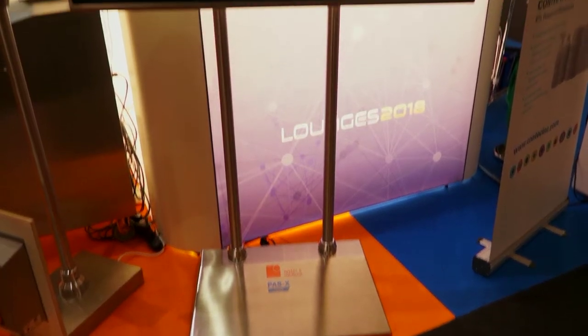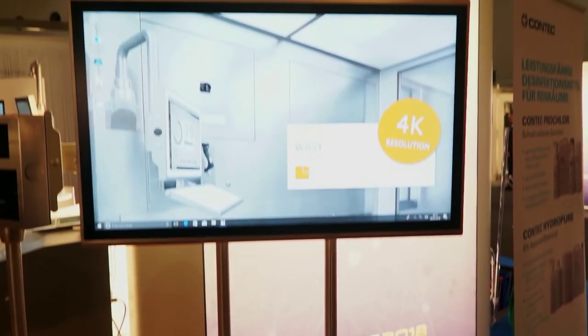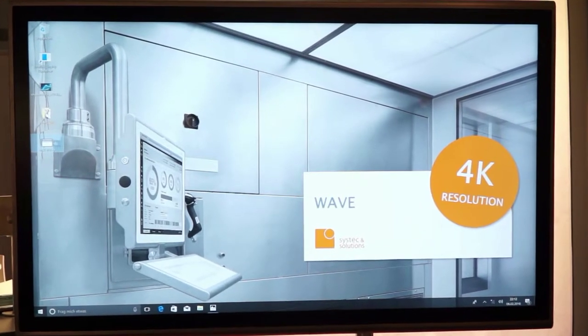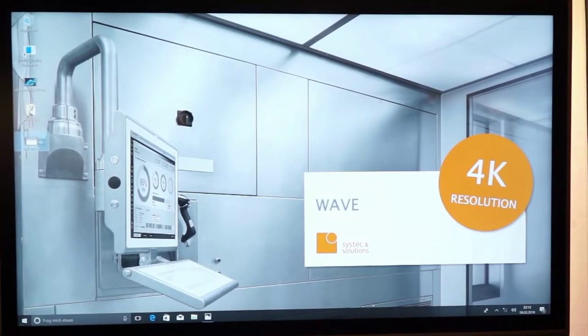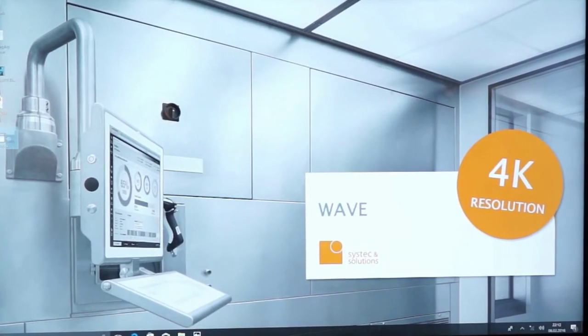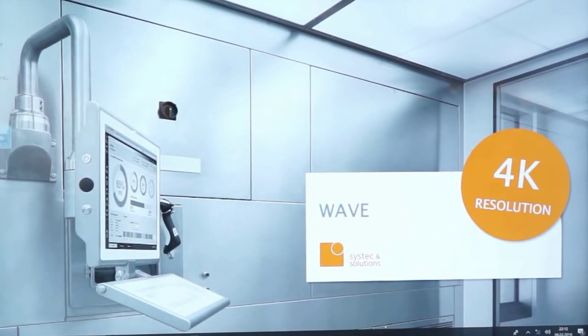The Wave display is available in various screen sizes starting at 19 inch, then 21.5 inch, 24 inch, 32 inch, and 55 inch. The 55-inch Wave is available with full HD and now also with 4K resolution.